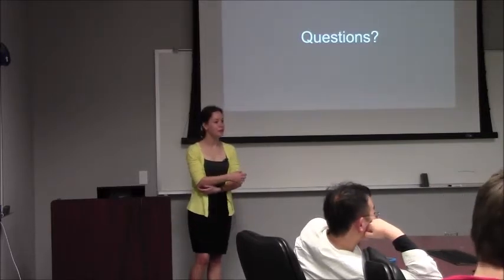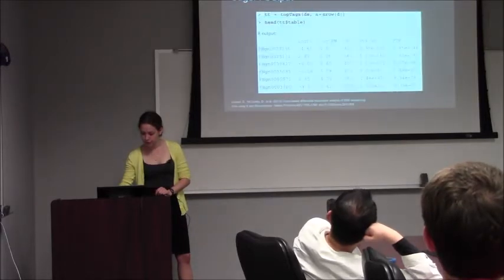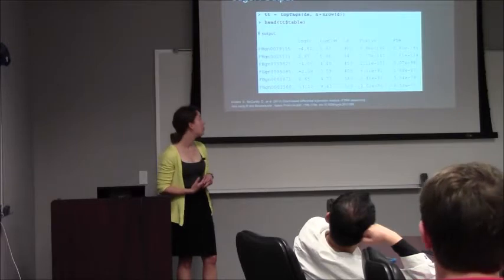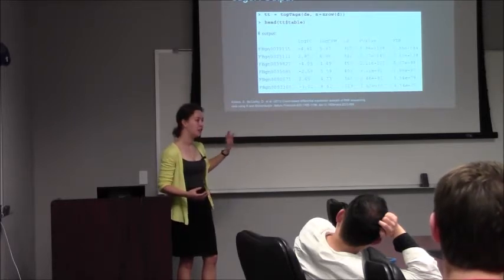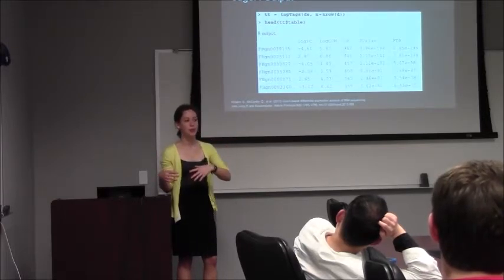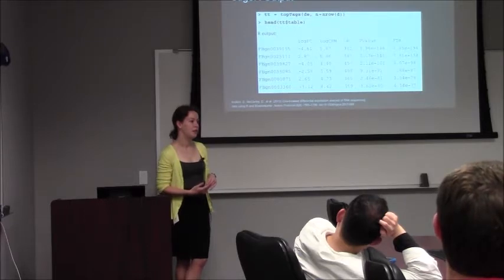A couple slides ago, you reported a likelihood ratio test and the p-value associated with it. What's the null of that test? Null hypothesis? Does that have something to do with whether the gene is expressed or to what degree it is expressed? So the specific null for that would be, in the likelihood ratio test, whatever you said to do. If you were working with the regression model and you were saying coefficient equals 2, it would be that parameter equals 0 in the negative binomial regression model. Okay.